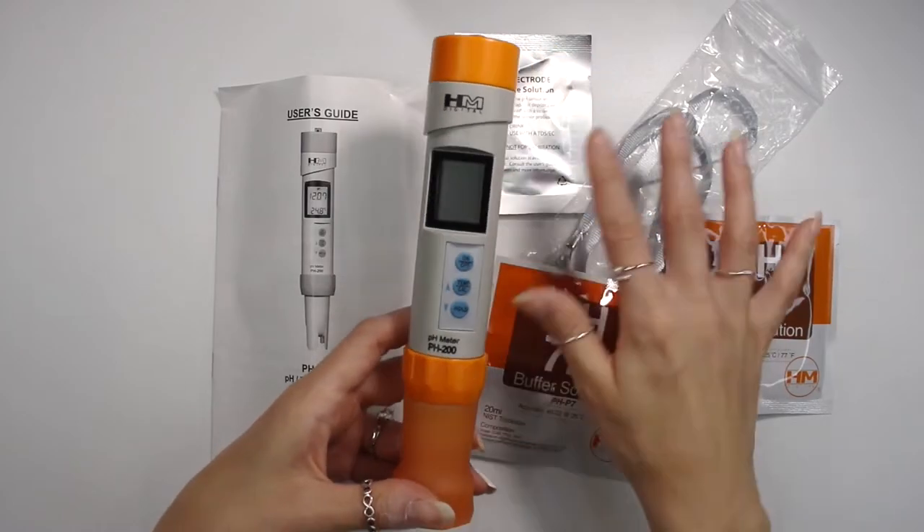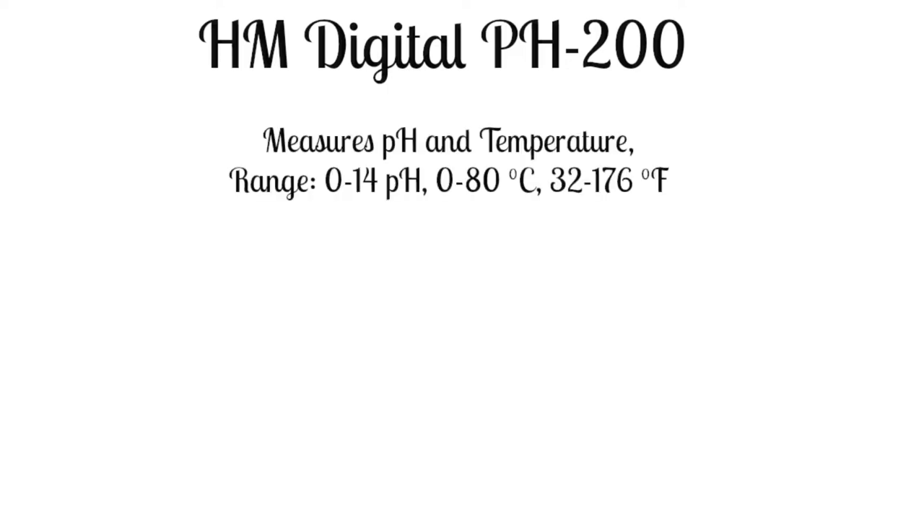Let's talk a little bit about the functions. This is called the HM Digital pH 200. It measures pH and temperature. The pH range is 0 to 14, and the temperature goes from 0 to 80 degrees Celsius and 32 to 176 degrees Fahrenheit. You don't want to use it in extreme cold or extreme hot temperatures — room temperature is really ideal for taking the pH of a product. This measures to 0.01 of a pH, which is great. I like when it goes to two decimal points rather than one. It is also waterproof.